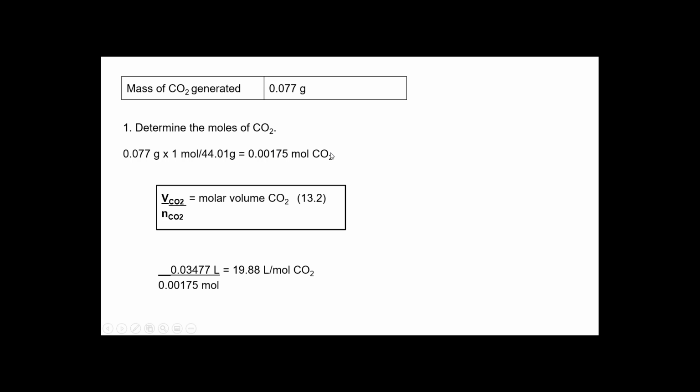So this is not difficult to do. My picture may be a little confusing, but once you understand the steps, it actually makes a little bit more sense, hopefully. Then we're going to plug it into this equation, which I did here. And for my molar volume of CO2, it's 19.88 liters per mole, which is exactly what I told you would not match the 22.4. I'm even forgetting myself now.